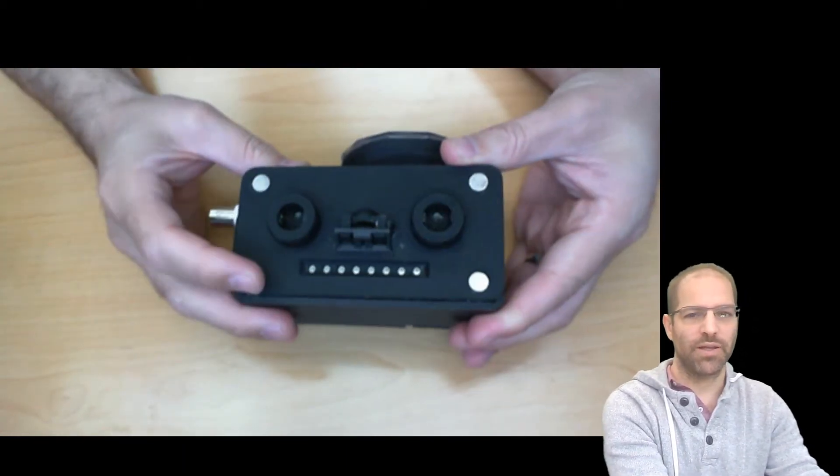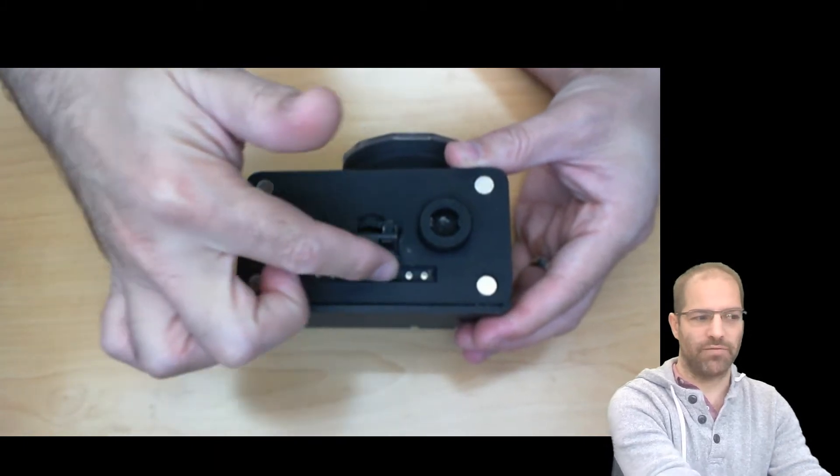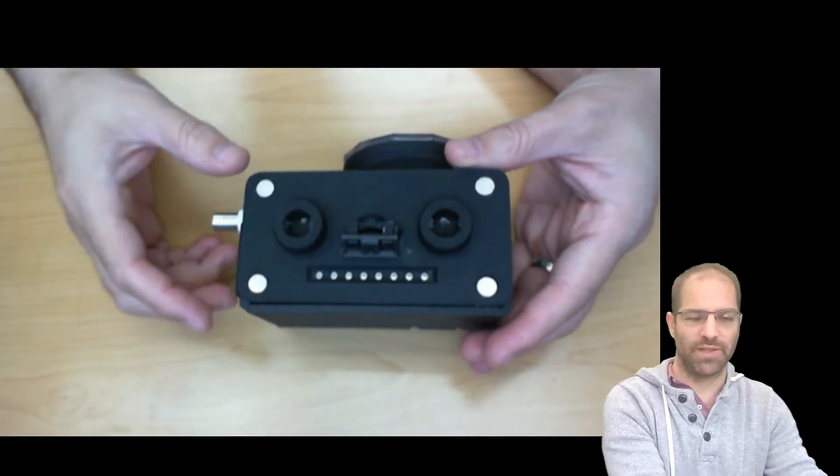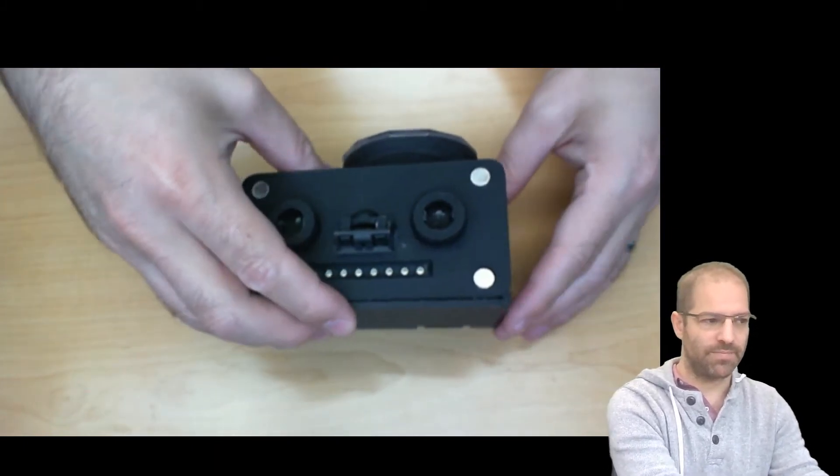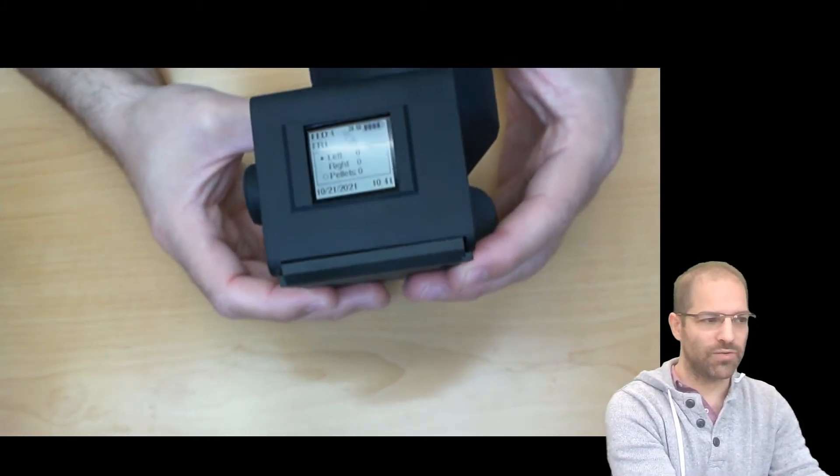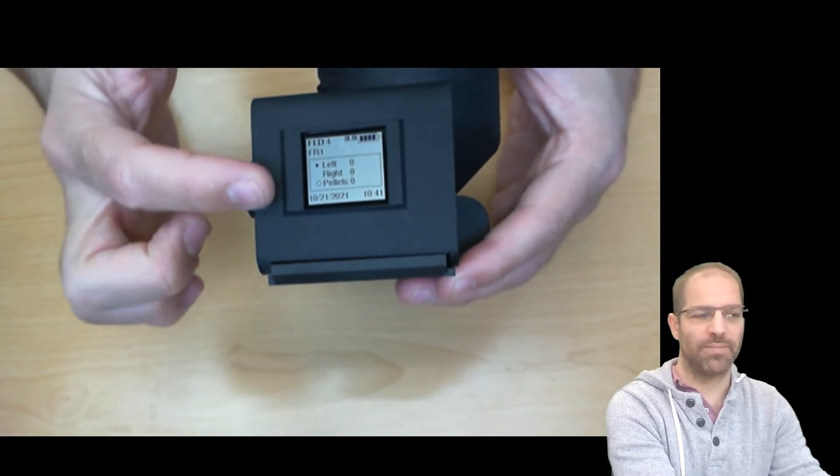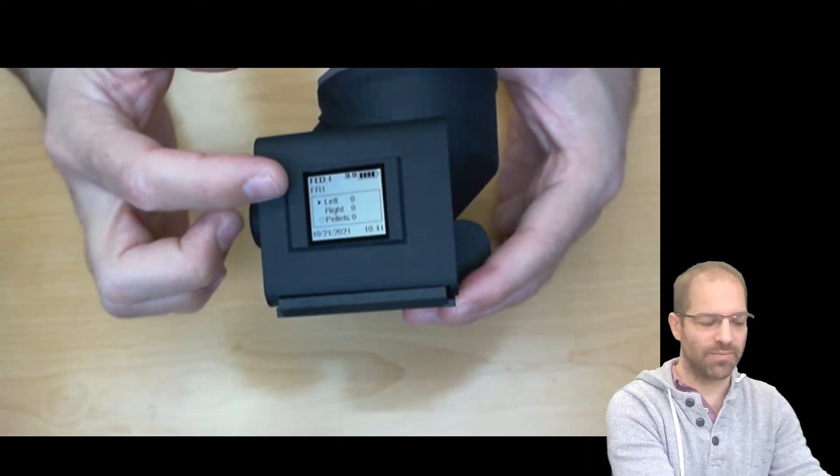It provides both audio and visual feedback to the mouse in the form of these eight multicolored LEDs, and it has a screen for user feedback so you can see data about your experiment.